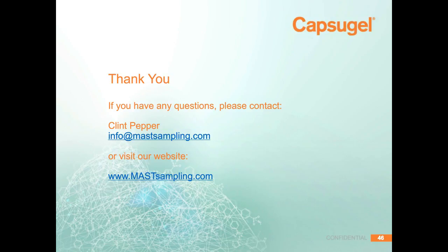Well, the connection of the Nova is relatively straightforward. We've done that quite a few times now, and so that process has been pretty well established. New connections sometimes take some time to develop and make sure we work through prototypes and get samples there more reliably. But connecting the Nova makes it very easy to use because you don't have to draw any samples or anything. And our system is set up so that once you connect the sample pilots to the bioreactors and connect them to the system, everything else is already pre-connected. So it's actually relatively straightforward.